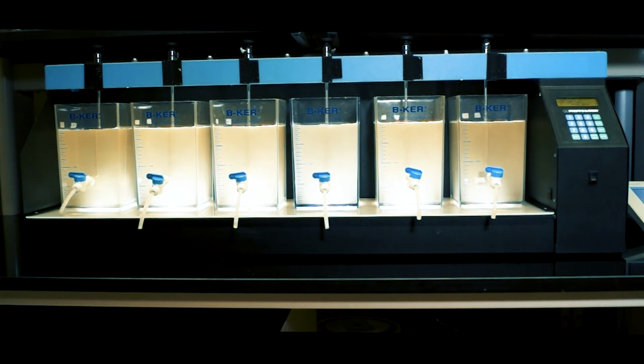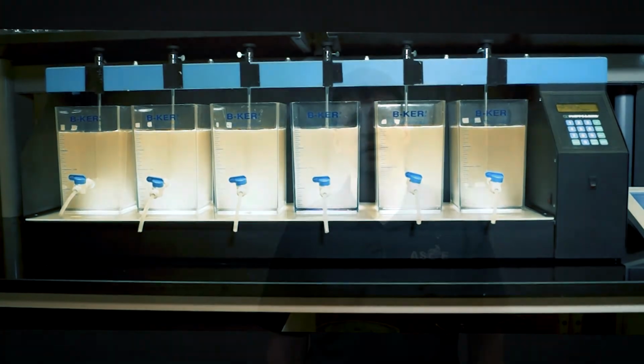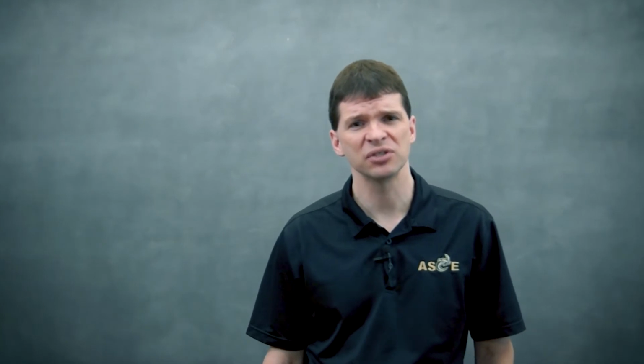The next generation jar testing procedure has two primary innovations. The first innovation is that the pH and coagulant dose are controlled independently through titrations so that it's a one variable optimization instead of a two variable optimization. The second main innovation of the jar testing procedure is to use granular media filters instead of sedimentation because not all treatment plants produce a large settleable floc.